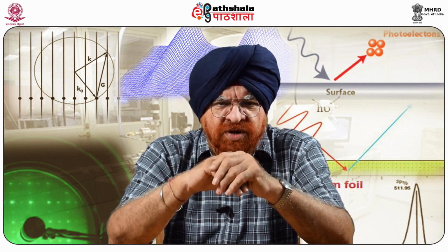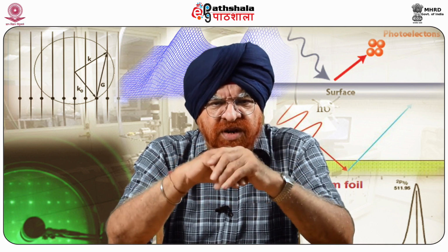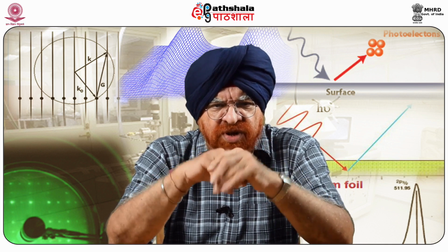Atomic force microscopy is a powerful tool for probing intermolecular interactions because it can resolve forces with piconewton sensitivity. That means at the piconewton level, one can analyze this, and it has a spatial resolution in the nanometer range.